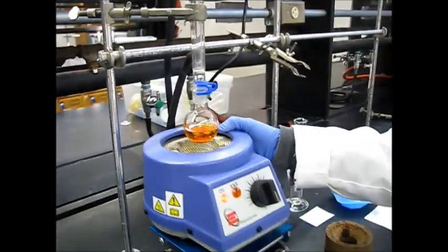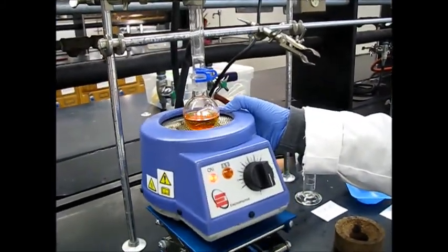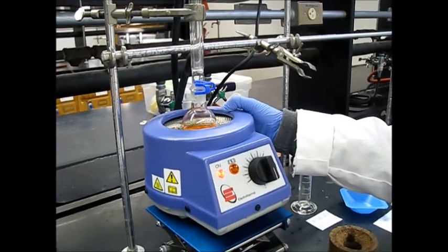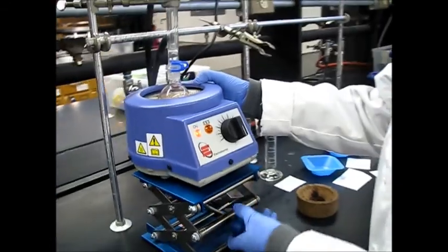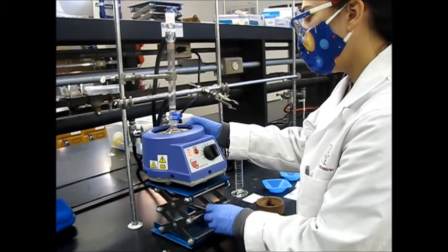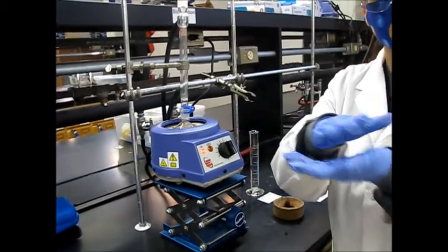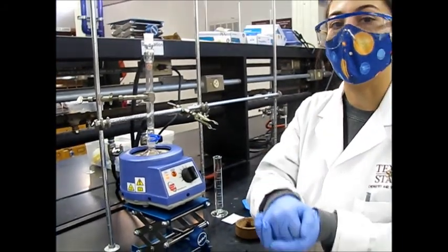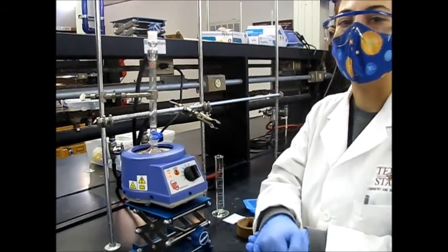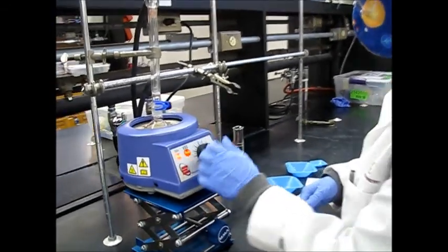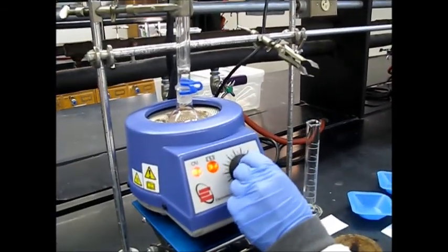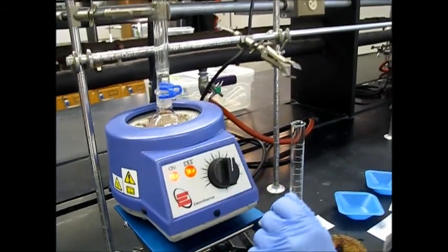And then you raise out the heating mantle and make sure that the round bottom flask is sitting directly on the heating mantle. Otherwise it won't heat properly. And then you're going to turn it up to around 6 and let it reflux.